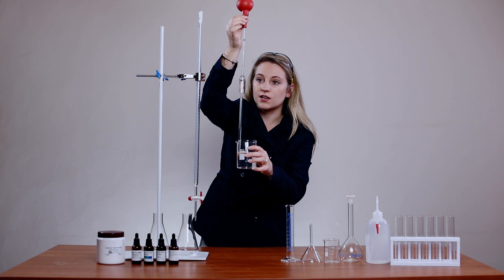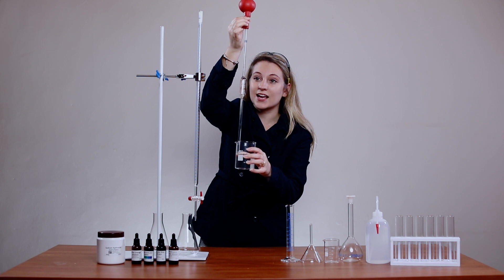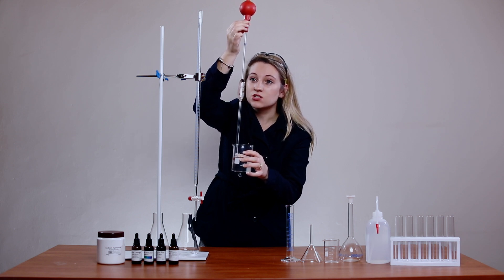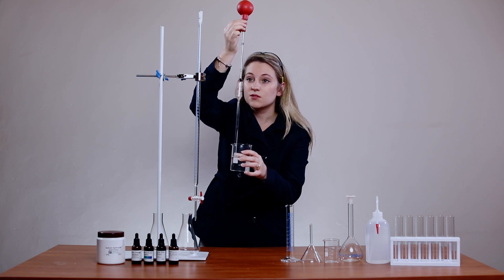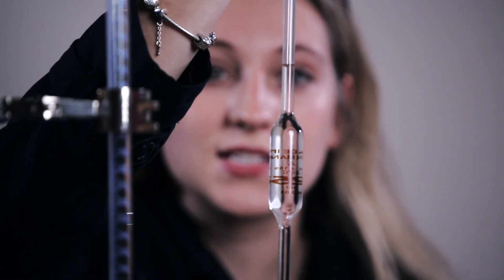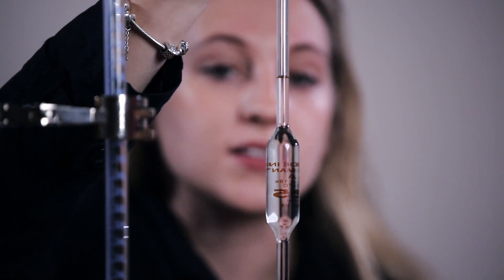This is where it gets really important because you need to make sure that the meniscus is exactly above that line. You need to check with your eye level. You can see it's not quite there so I'm just going to push it slightly until that meniscus is absolutely perfect and that's exactly 25 milliliters.